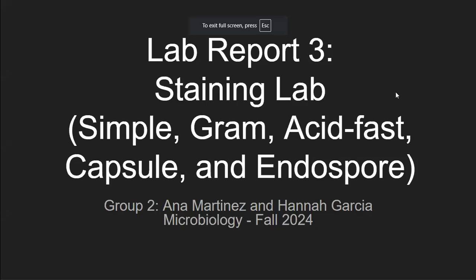Howdy, this is Lab Report 3, Staining Lab. Simple, gram, acid fast, capsule, and endospore. Group 2, Ana Martinez and Hannah Garcia, Microbiology Fall 2024.